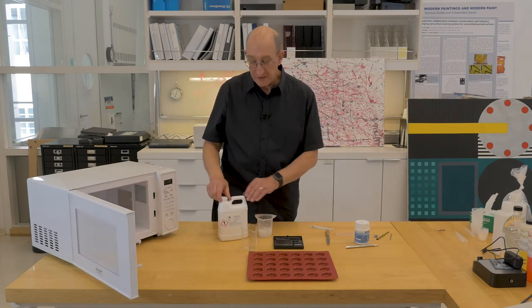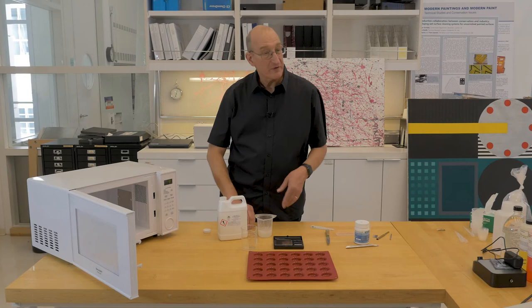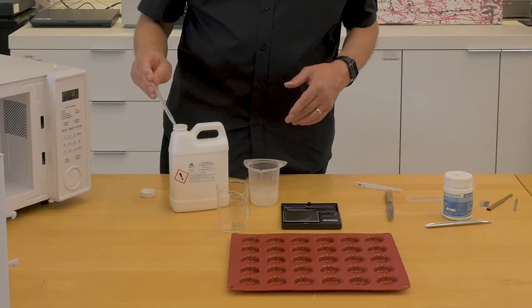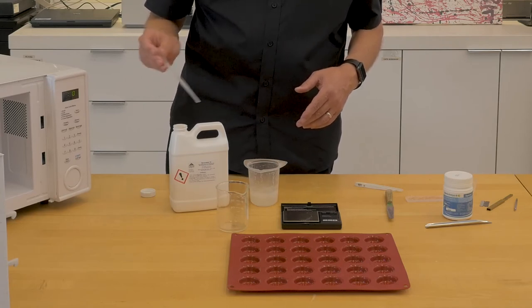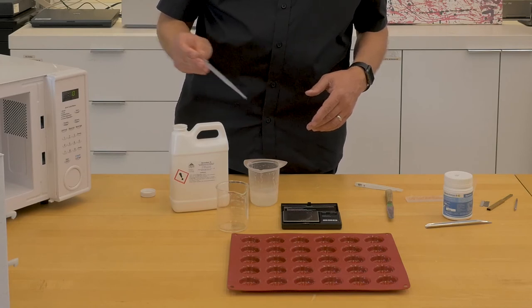You have a choice at this point of adding a preservative or not. Without the preservative, it will be a wonderful medium for mold to grow. With the preservative, you have to wash the preservative out before using it for measurement.